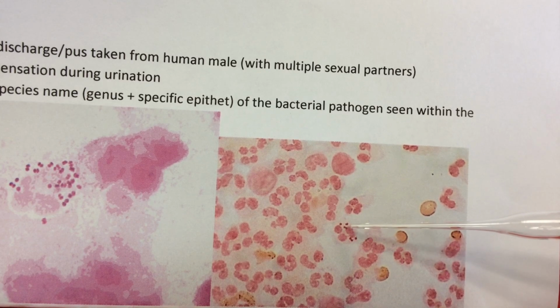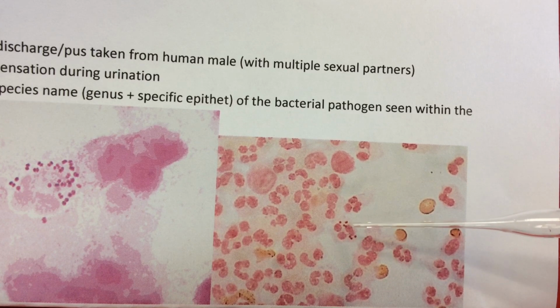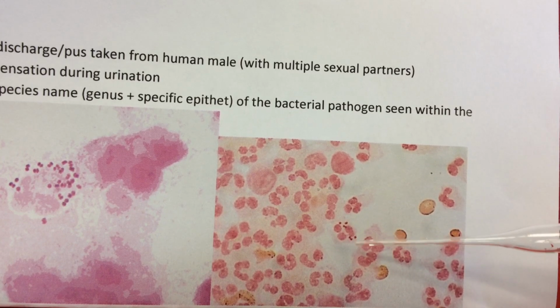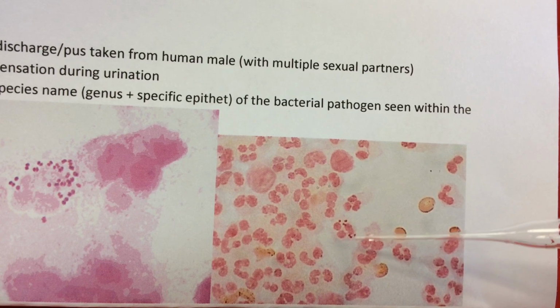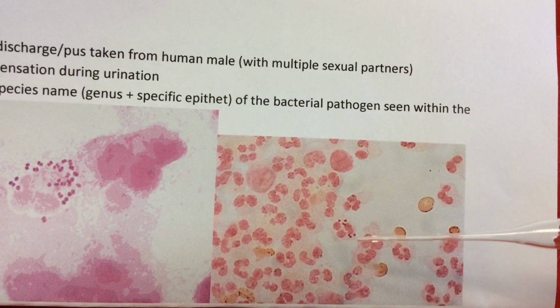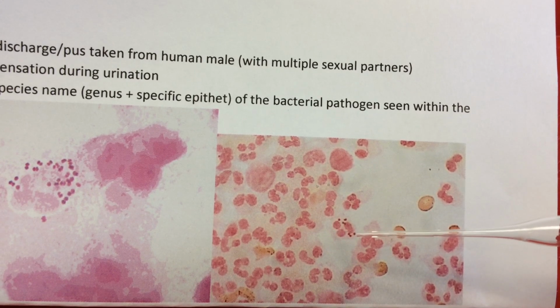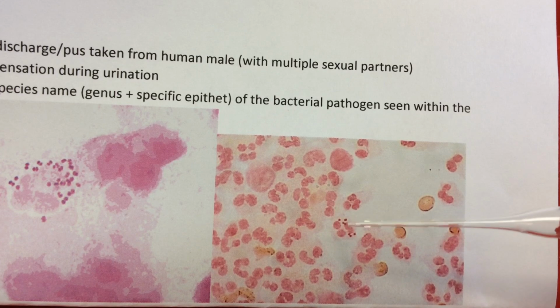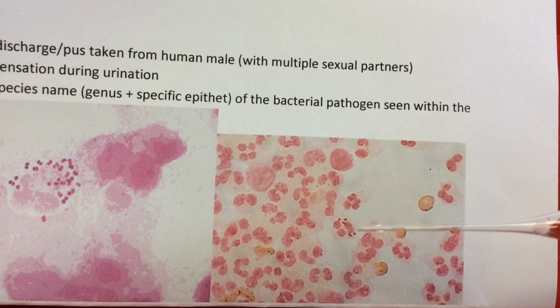those are the bacterial pathogens, the Neisseria gonorrhoeae. So an individual cell is called a coccus. It looks like a little ball. Very often when the Neisseria gonorrhoeae divide, often two cells will remain attached, forming a pair of cells that we refer to as diplococci, classic for Neisseria gonorrhoeae. So we see here, here's a neutrophil who's successfully phagocytized and will try to destroy 1, 2, 3, maybe 4, 5, 6, 7, at least 7 Neisseria gonorrhoeae cells.